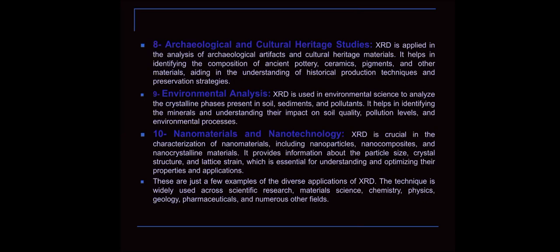Tenth one, nanomaterials and nanotechnology. XRD is critical in the characterization of nanomaterials, including nanoparticles, nanocomposites, and nanocrystalline materials. It provides information about the particle size, crystal structure, and lattice strain, which is essential for understanding and optimizing their properties and applications.